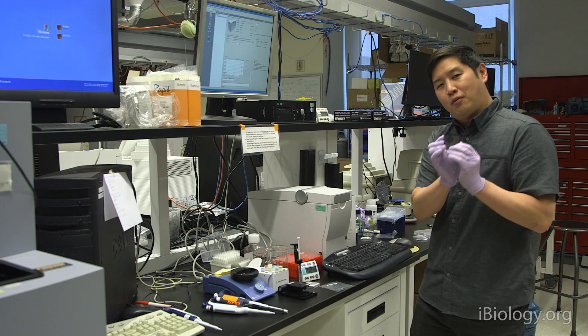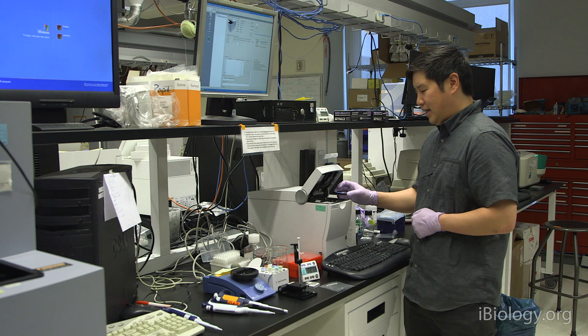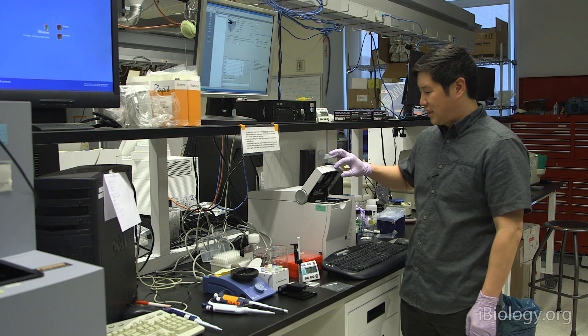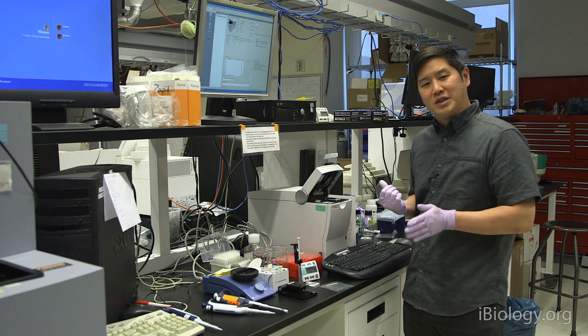This chip, once it's prepared, will go into this Bioanalyzer instrument. And this instrument has a location to hold the chip, as well as an optical detector at the bottom to detect the passing nucleic acids, and an electrode array on top. This electrode array on top is what causes the different samples to pass through the chip and migrate towards that detector.